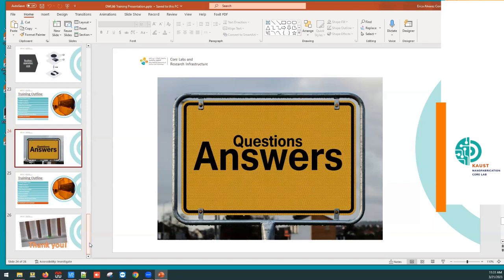I have to say that this SOP is not the final version, okay? Because I was running literally to finish this version, but at least to give you all the steps to do this exposure. I need to complete many of the other parts of the SOP, because in the SOP we will have the alignment, the high resolution, and all these more advanced operations, but not in the current one.